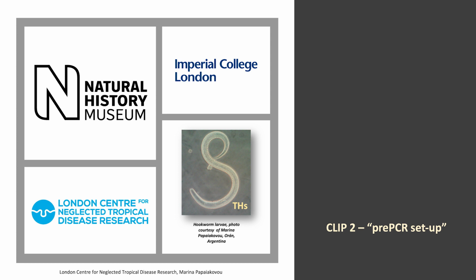Hi there! In this video, I am explaining how to resuspend primers and probes for qPCR for soil-transmitted helminths, how to prepare the master mix solution, and how to load the PCR plate.